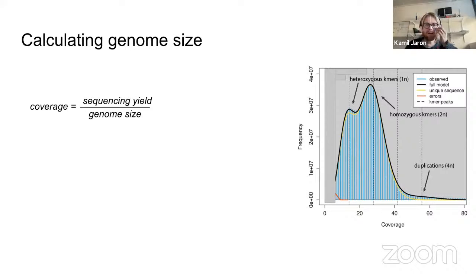Yeah, okay. So what you actually don't want to do, when you do this kind of model, is interpret this length as the genome size, because truly the repetitions absolutely cover large parts of the genome, right? We actually intuitively all know that. So we cannot just take the main bit. What we have to do instead is use the same trick as we use for sequencing coverage.